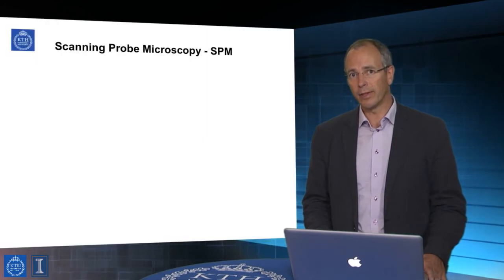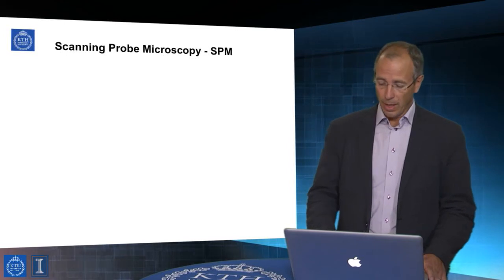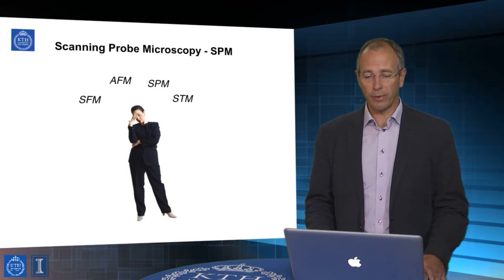Welcome to the first of a series of lectures on scanning probe microscopy. This is a catch-all term that refers to a whole family of different imaging techniques which have revolutionized our understanding of surfaces at the nanoscale and our ability to engineer them. So it's an area which is characterized by a whole series of different acronyms. You can see a few of them here.